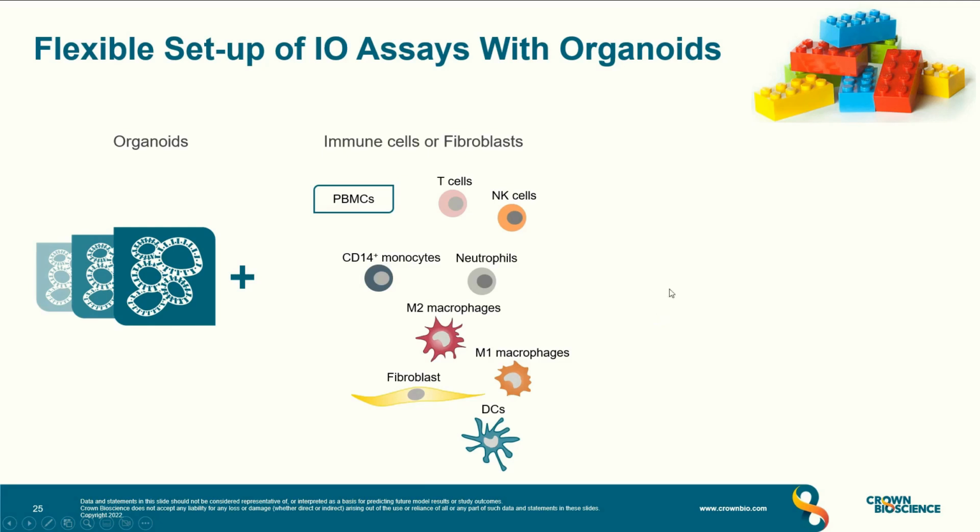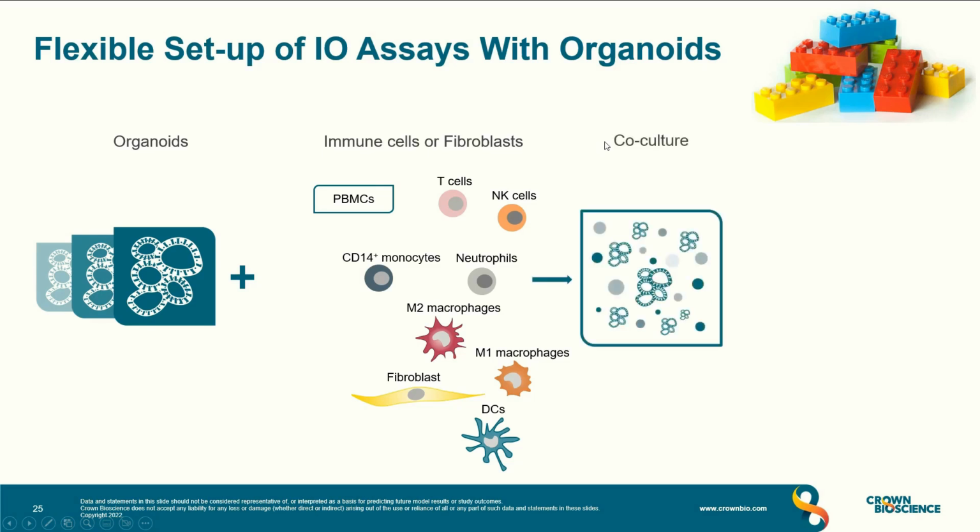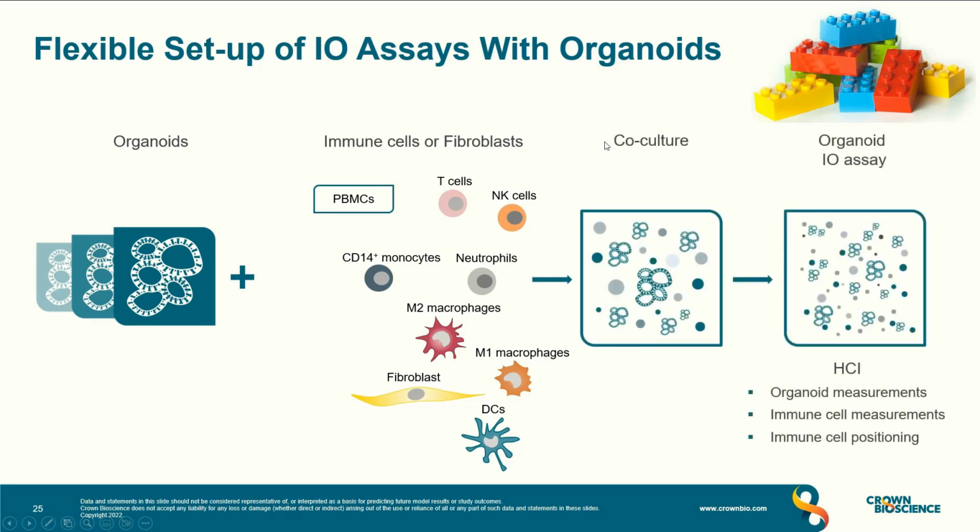lymphoid cells, as I said, like small Lego blocks to reconstitute the tumor of interest with the cell lines of interest, and then use these co-cultures to make all kinds of measurements on killing, infiltration, polarization, and hopefully, this will help with discovering some very interesting therapies in the near future.